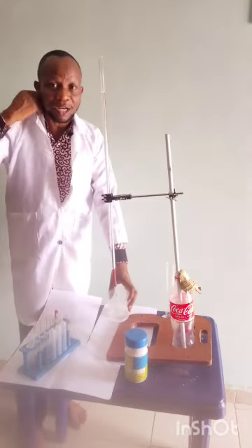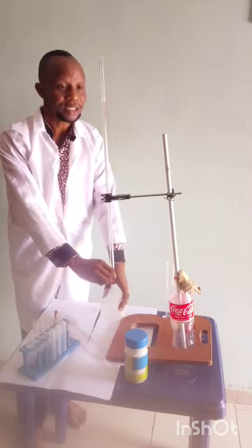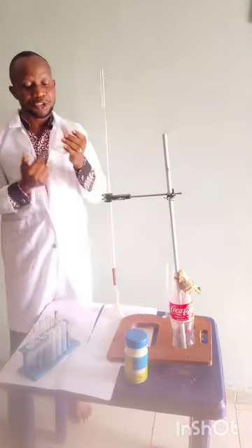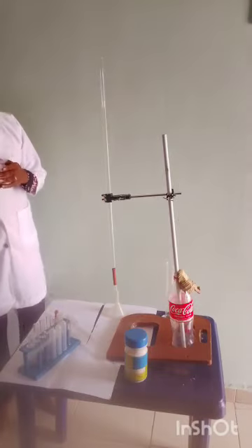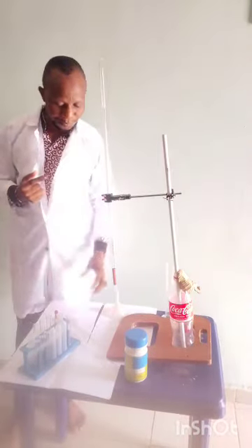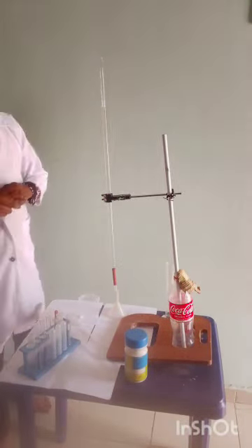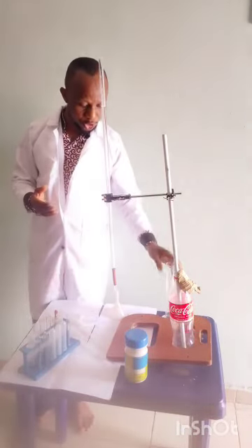Then you titrate by swirling gradually until the end point is reached. The end point in an acid-base titration is a color change. If it is methyl orange, it is expected to turn pink. The last drop turns pink, and if it is phenolphthalein, colorless is the end point, as the case may be, depending on what instruction you have.